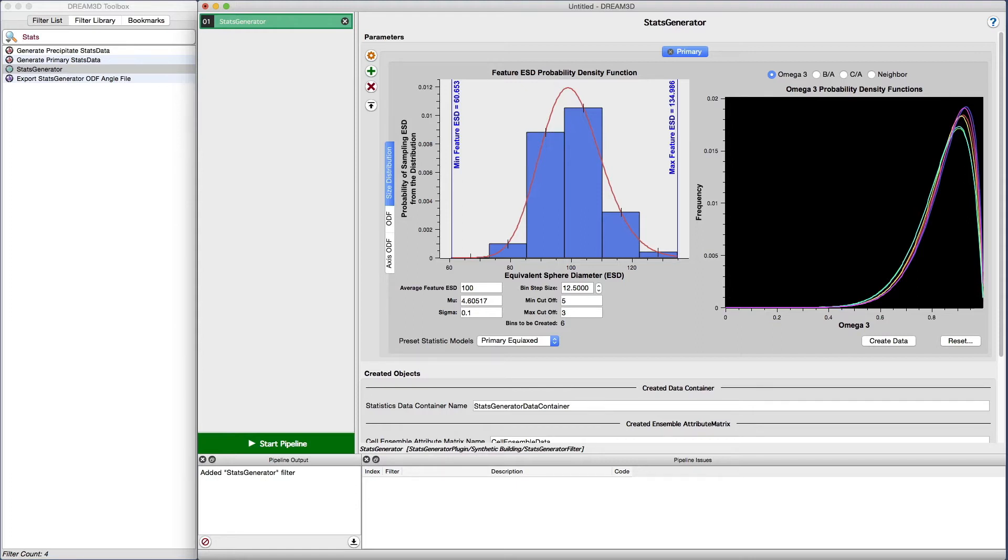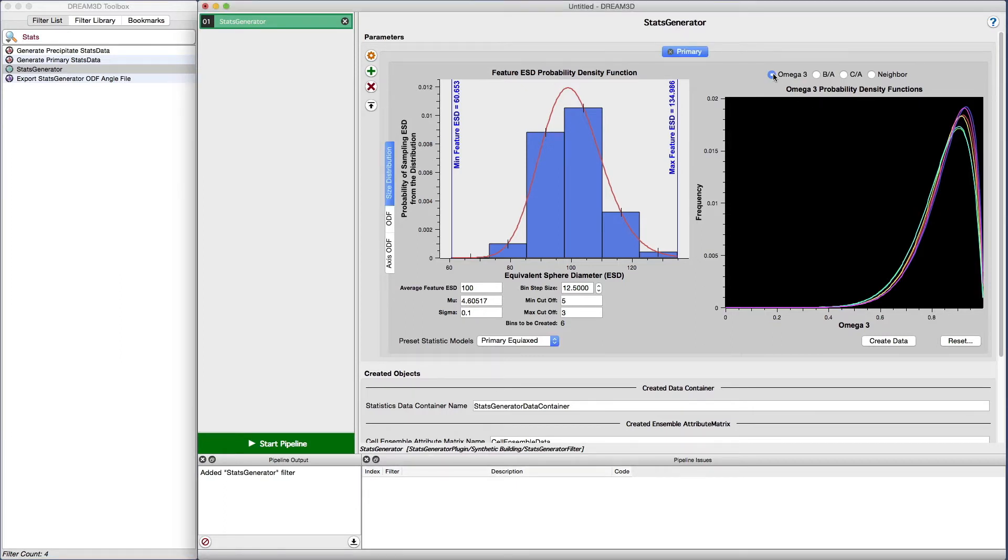A number of distributions were just calculated, so let's take a second to take a look at them. The omega-3 plots show the distributions that will be used to generate the basic shapes of the grains. There are several reference papers that are good reads to fully understand how this variable works.